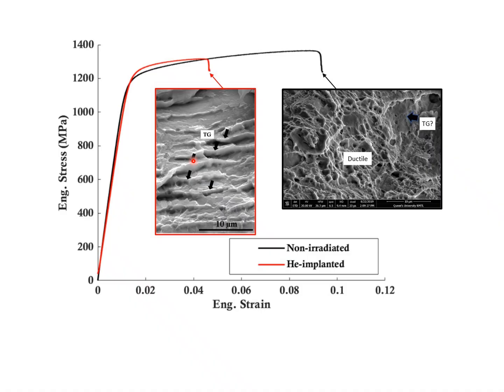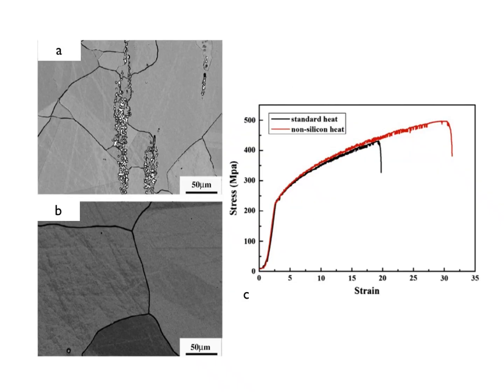You don't need to have the helium segregation, but it certainly helps to have, well, the interface is the important thing. And if you have helium, that just makes it weaker. The reason I say that is because even in unirradiated material, you can have bands of what, in this particular case, are called stringers. It's the bands of impurities.